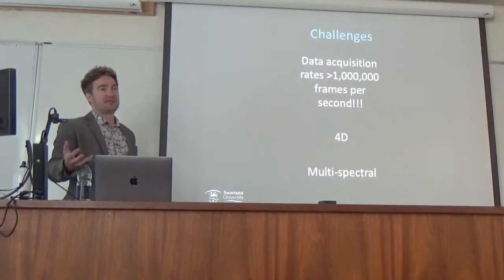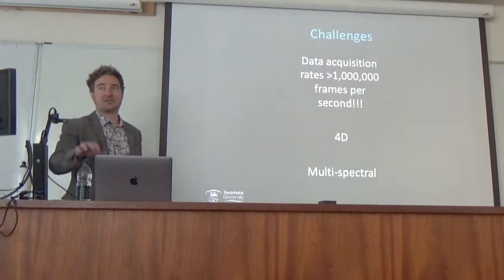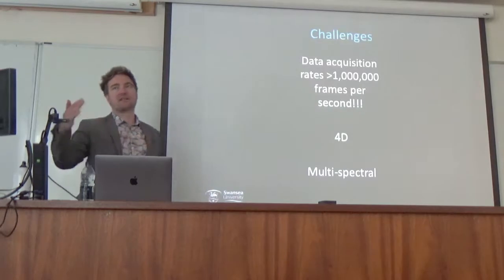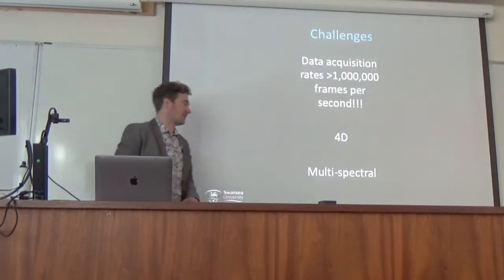And so 4D, even in our lab, slow imaging, 4D creates challenges with handling the data because you have multiple data sets you're trying to handle at the same time. And segmenting, if it's a segmentation problem, then it just scales with the more scans you have of the same sample. And then multispectral is developing as well.